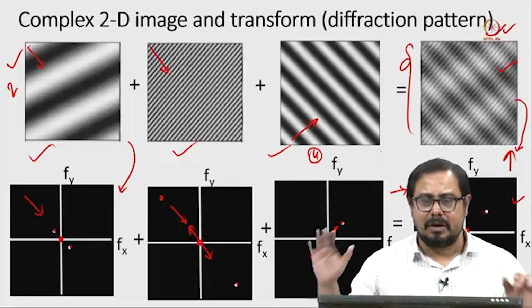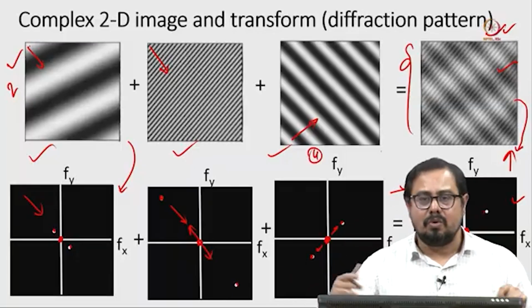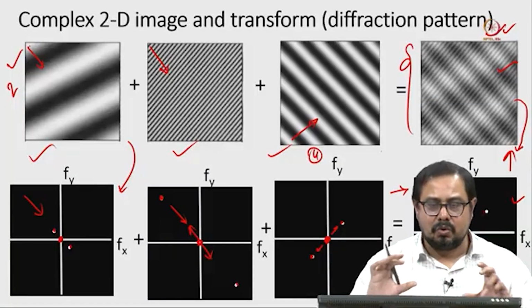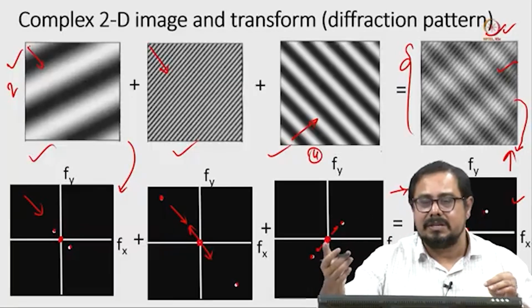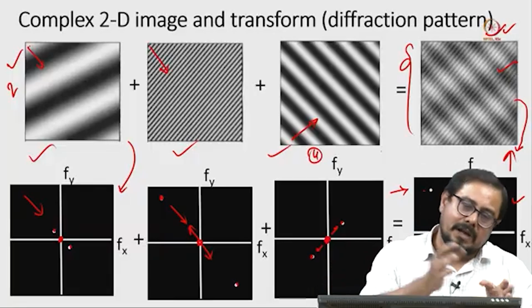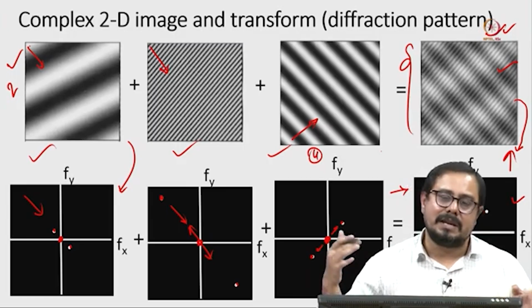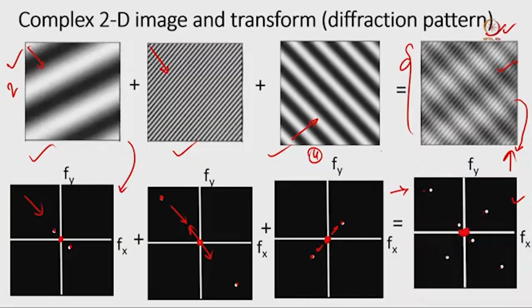This major part, the diffraction pattern and image formation, I am going to finish today. Then we will go for the real sample preparation and real imaging. These 2 to 3 classes are required to connect image formation with the diffraction pattern, and how we do the decomposition of different kinds of complicated functions, because in the later stage when you do data processing, all these things we have to use, but no mathematical details will be discussed. In the next class I will probably talk a little bit about diffraction pattern related topics, and then we will discuss sample preparation.